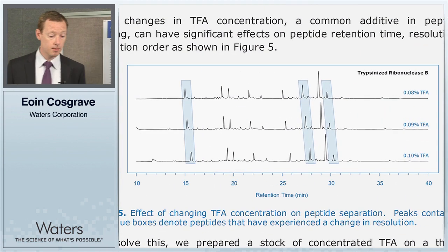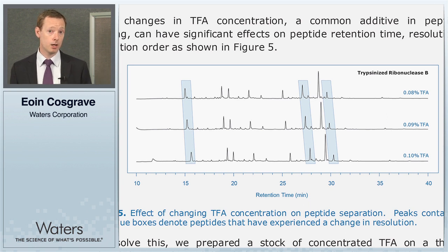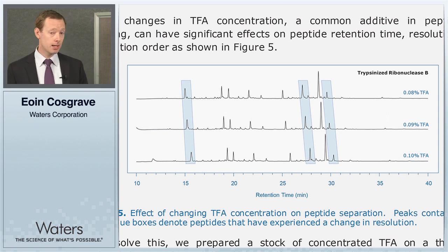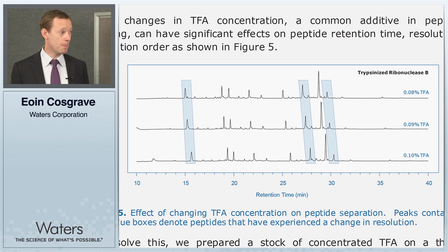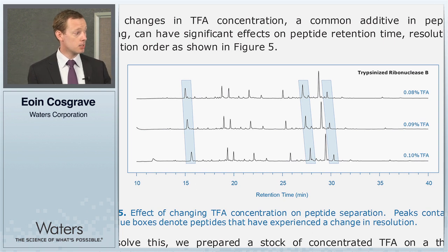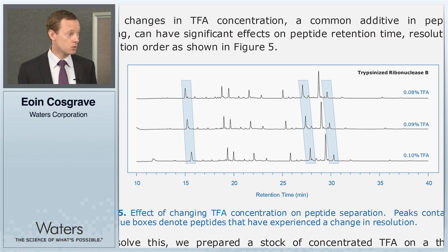To use more of the tools available on the H-class Bio, we decided to remove the acidic modifier from mobile phases A and B and instead include it on a third solvent line using AutoBlend Plus. The reason we use AutoBlend Plus for controlling the delivery of TFA is that slight adjustments in TFA concentration can have a large impact on chromatography — demonstrated in figure five, where adjusting TFA concentration by 0.01% increments shows that those subtle changes have a big impact on the resolution of those peaks.